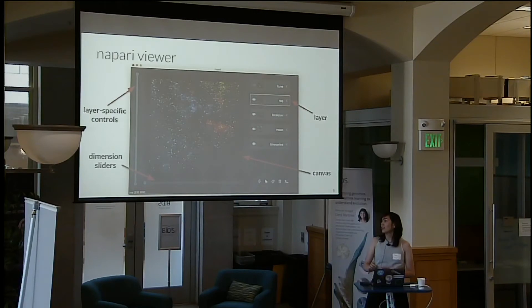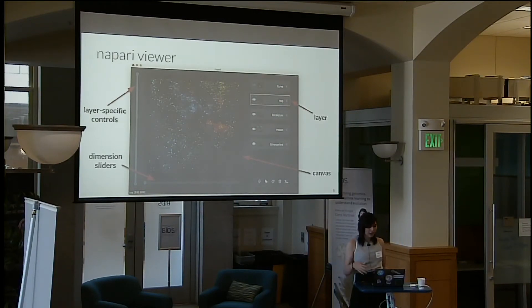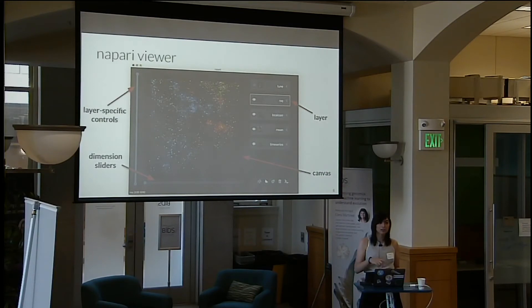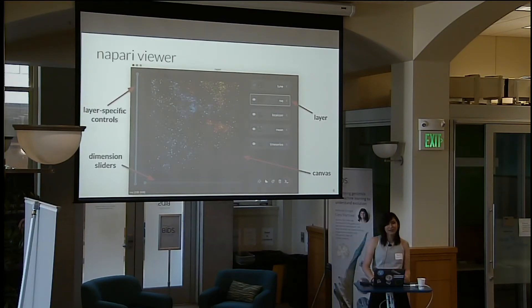These are the dimension sliders, and this is what gives NAPARI its n-dimensional capabilities. You can use these to slice through any amount of dimensions that are not currently being viewed. There's also this cool little button over here — when you press it, it will launch an IPython terminal within the window.